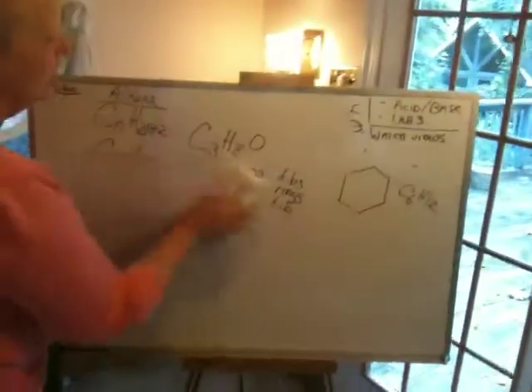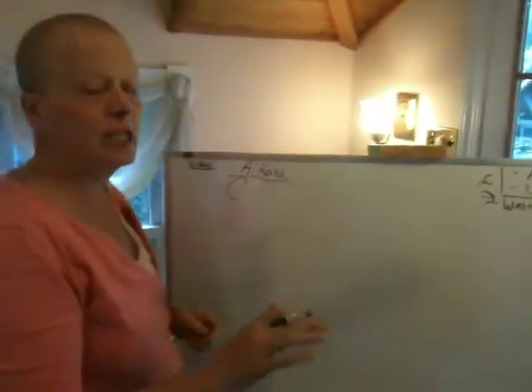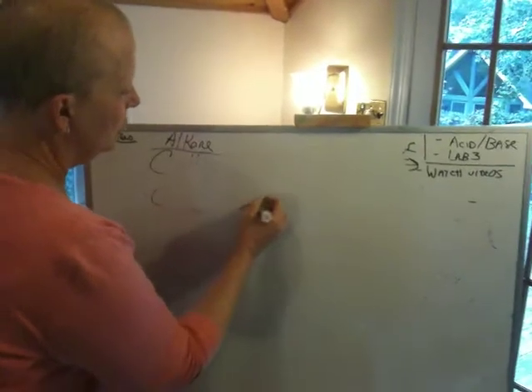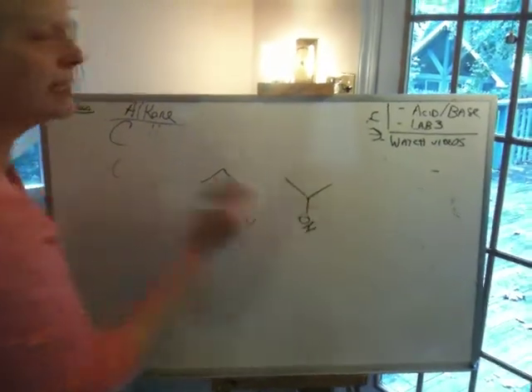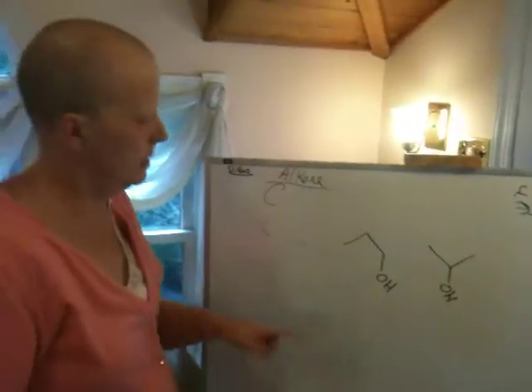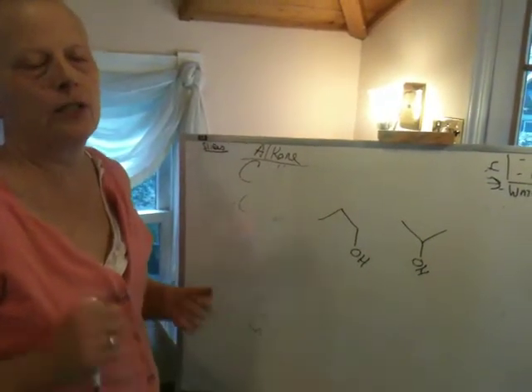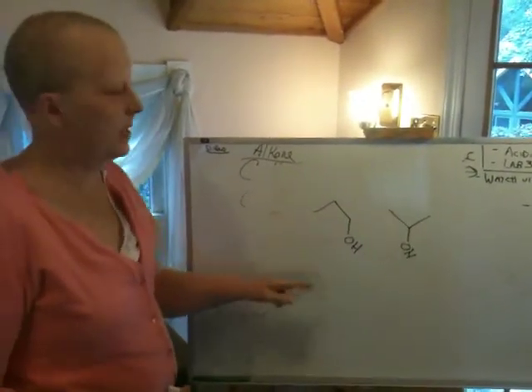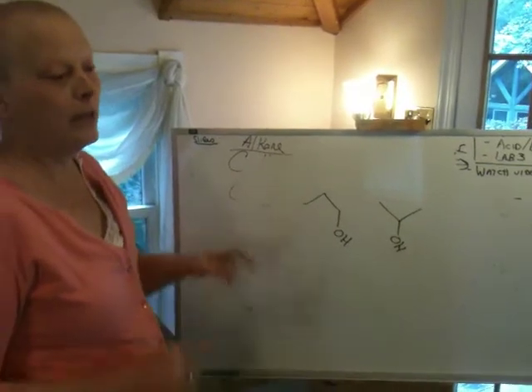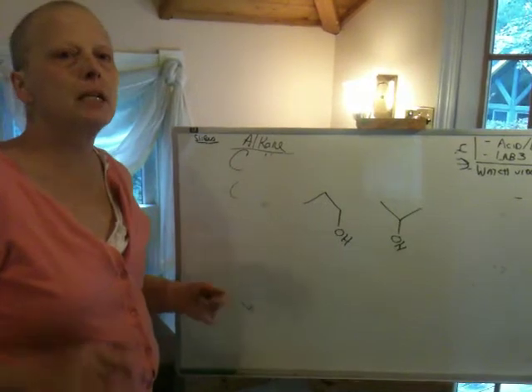We know it's an alcohol because of the topography. I'm showing you what an alcohol looks like. With this information, even if I just had the spectrum and the formula, there's only 2 compounds that fit the bill. With the tiny bit of information we interpreted, that is, it has an OH, and the rest of it's all saturated, there are no double bonds, no rings, no triple bonds in the molecule, these are the only 2 things that fit: 1-propanol and isopropanol.